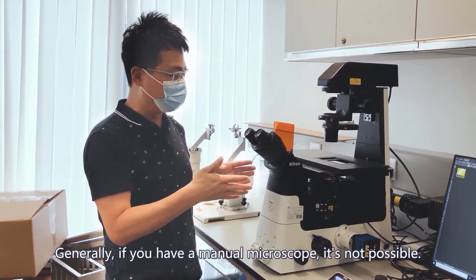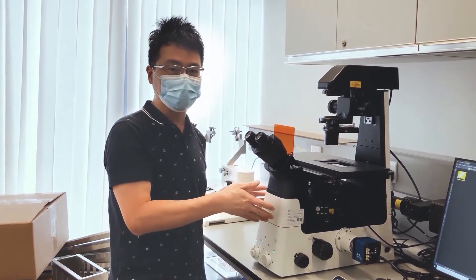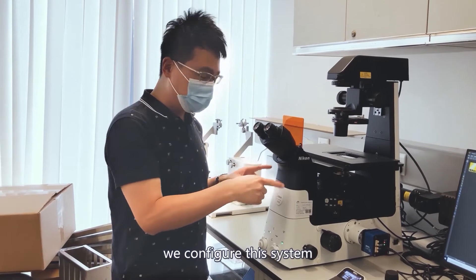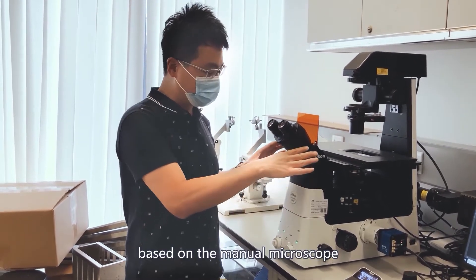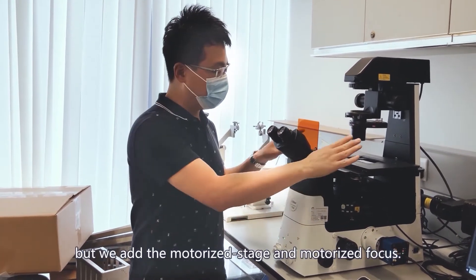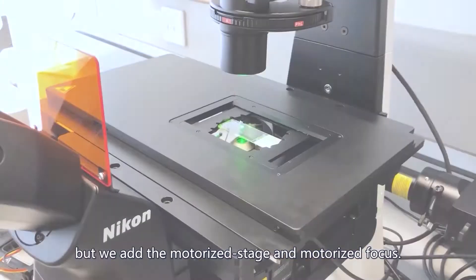Generally, if you have a manual microscope, it's not possible. But this time, we configure this system based on a manual microscope, but we add the motorized stage and motorized focus.